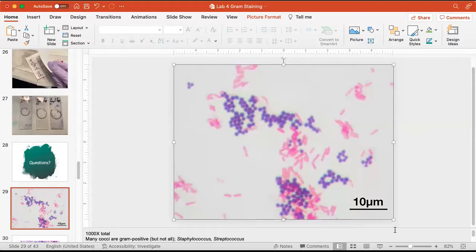I'll tell you, if there is grouping here, it's subtle. It's subtle, but there might be some grape clusters in the coccus species. This might be some real clustering in the cocci. Clustering is actually quite common, remember, for Staphylococcus. This could be a Staphylococcus organism. I don't see any obvious grouping in the rods. Now, I do see places where one or two rods have formed a chain.